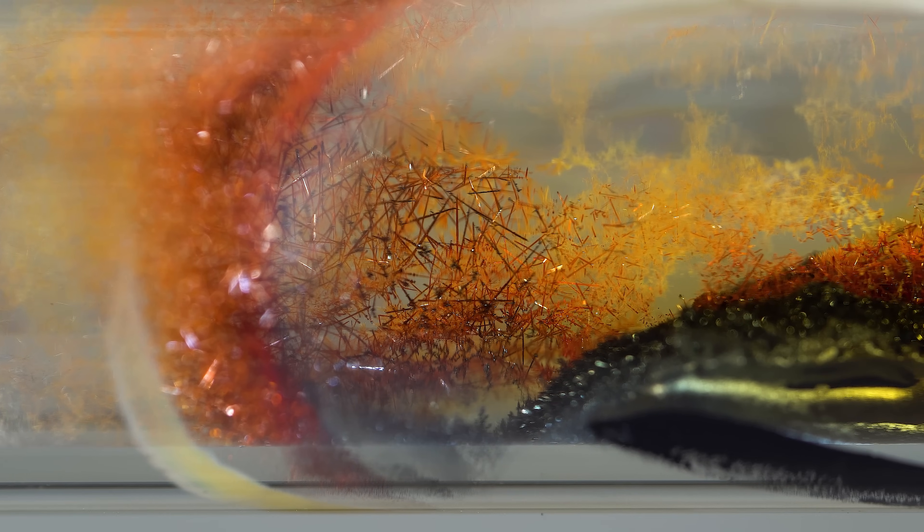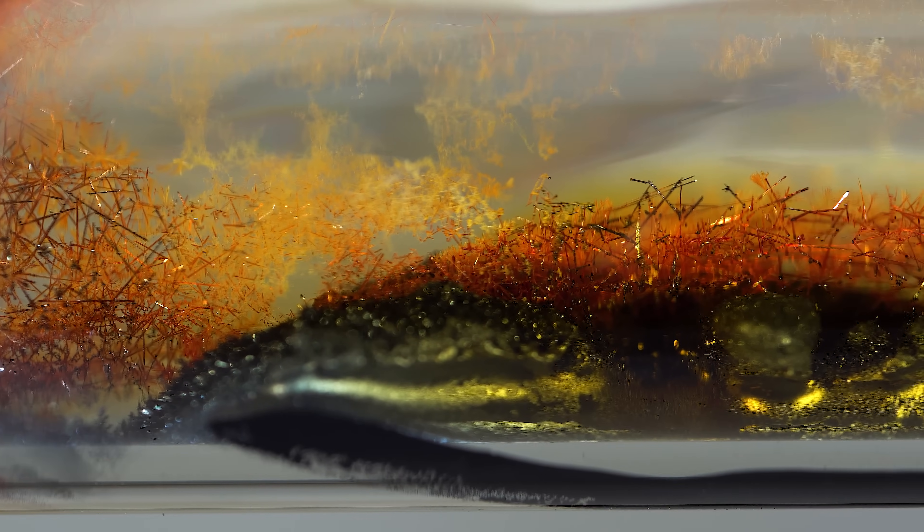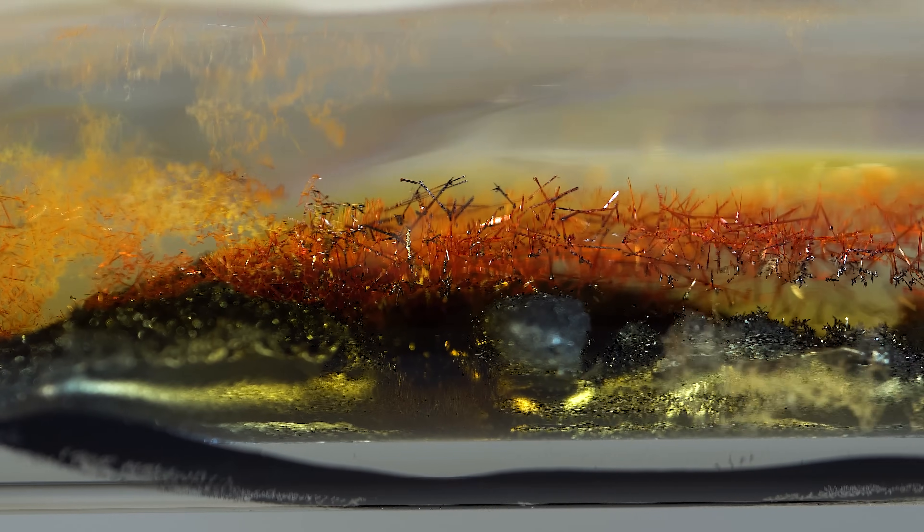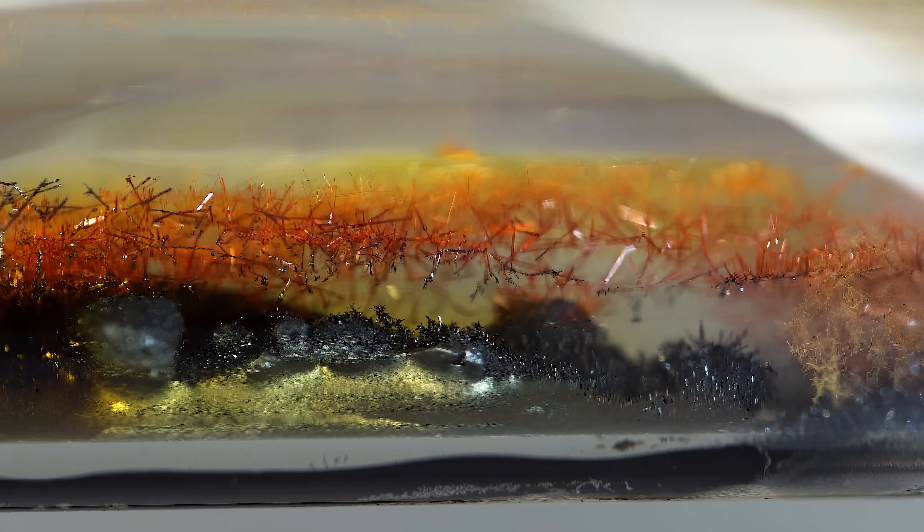These dark red needle-shaped crystals are tungsten oxytetrachloride, which in humid air rapidly transform into yellow tungsten dioxodichloride.